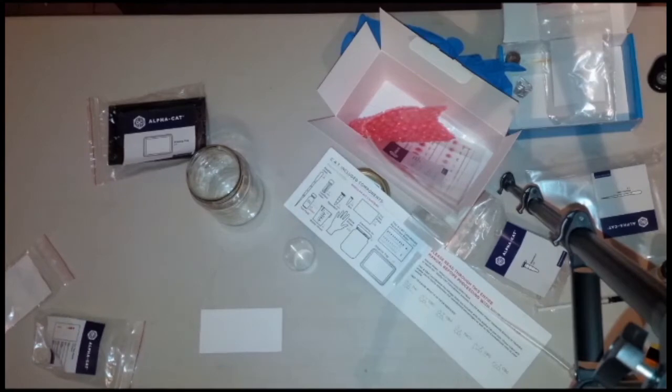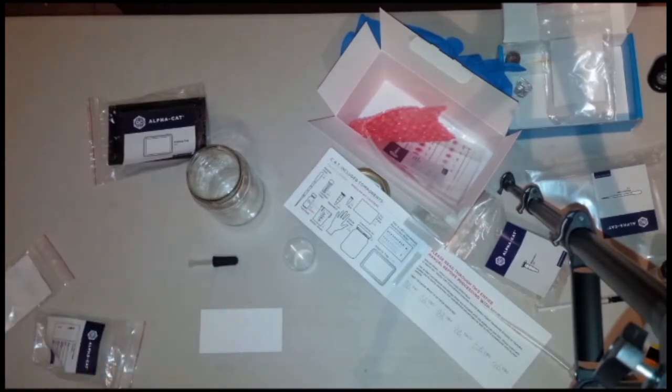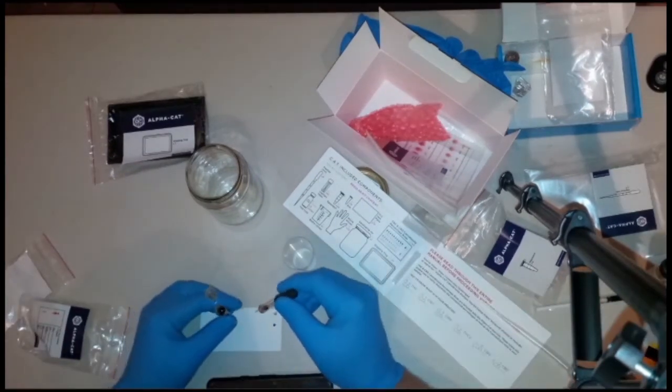The next stage is to release the contents of the capillary tube on each spot on the test plate. Again, take your time. It's a little bit fiddly, but perfectly easy to do if you just take your time.